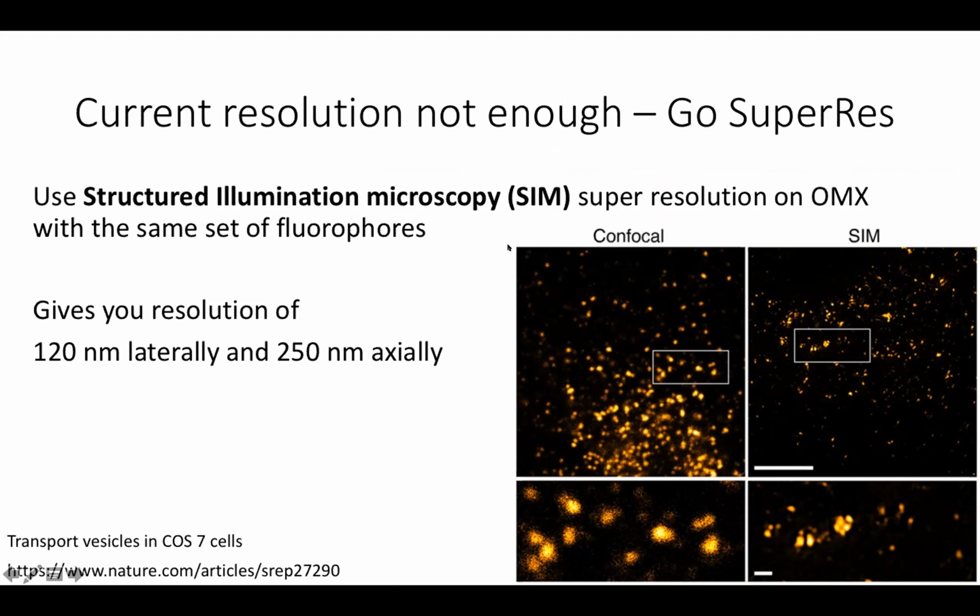Now, the sample preparation for SIM is pretty much similar to what you will be using for confocal, but sample preparation for STED is a little different. So you cannot use the same antibodies that you are using for either confocal or SIM.